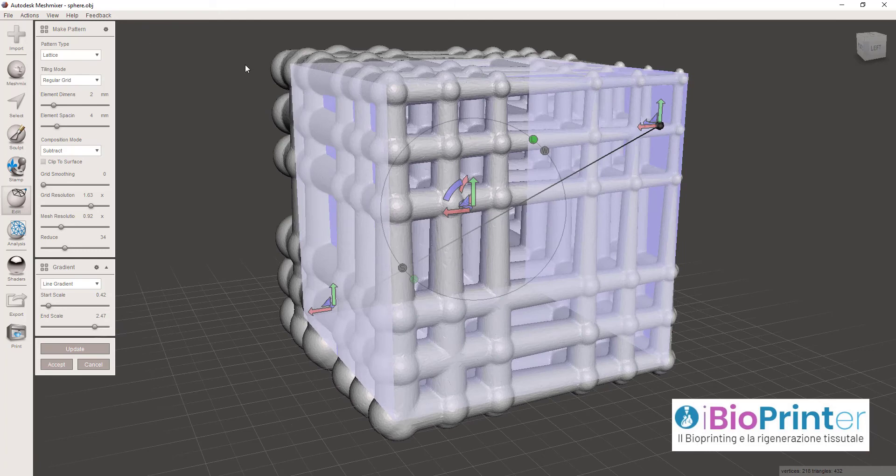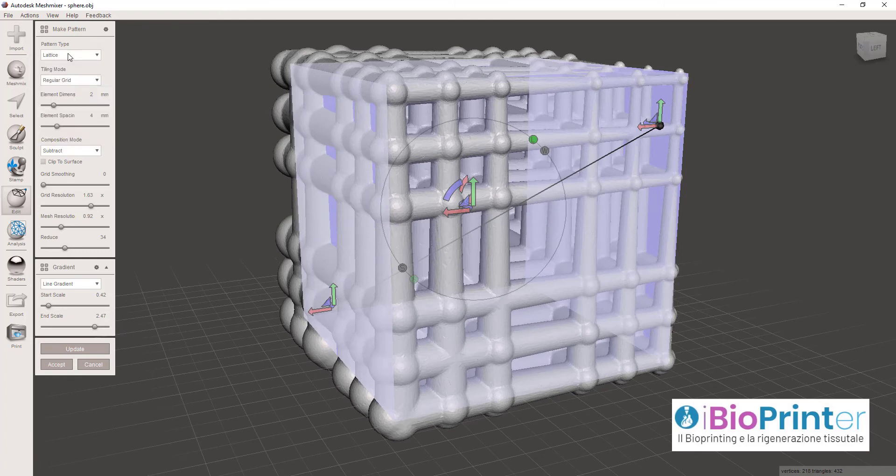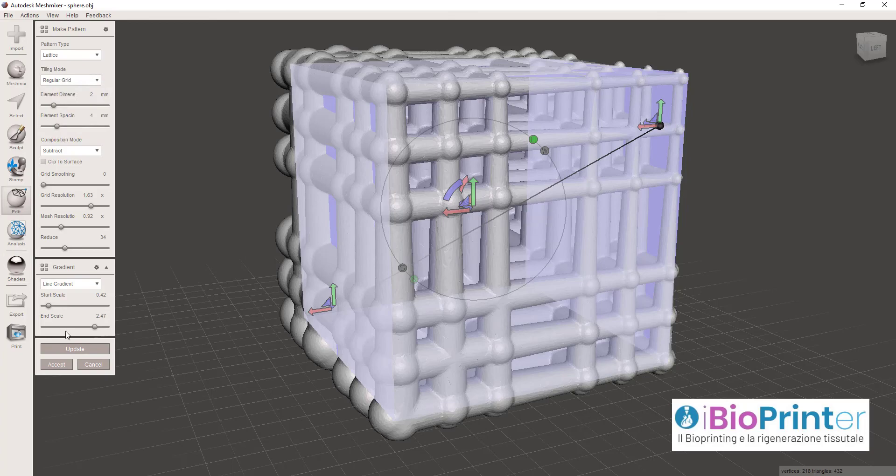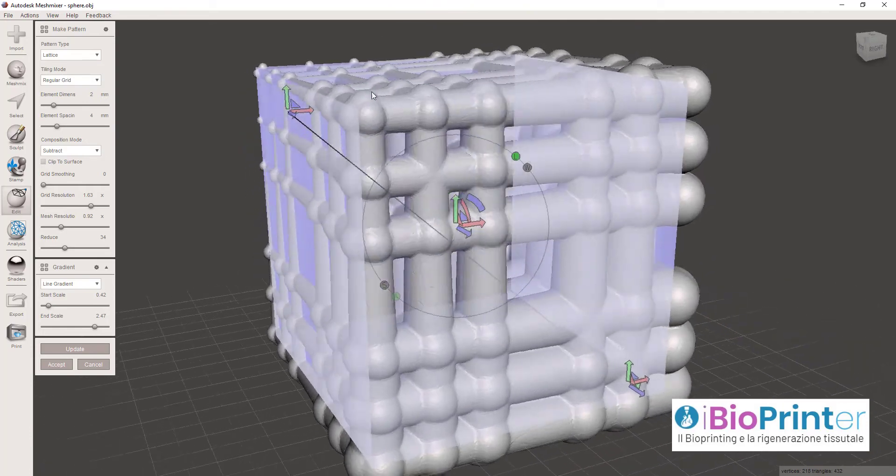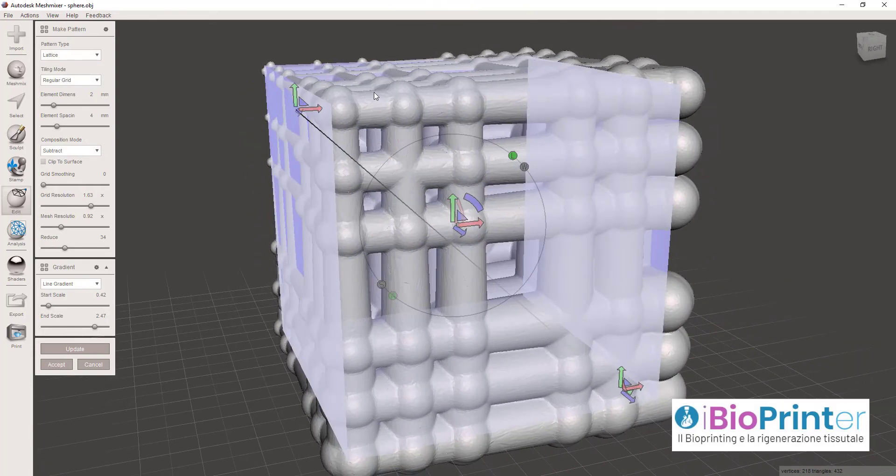Ovviamente le combinazioni che potete creare sono tantissime, infinite. Vi consiglio di smanettare un po' con questo software, utilizzarlo per capirne meglio le funzionalità e l'utilizzo in base alle vostre esigenze.